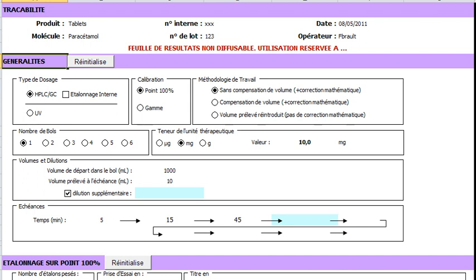The full correction if the aliquots are not replaced, the intermediate correction if the aliquots are replaced with fresh medium, or no correction at all if the aliquots return into the vessel.